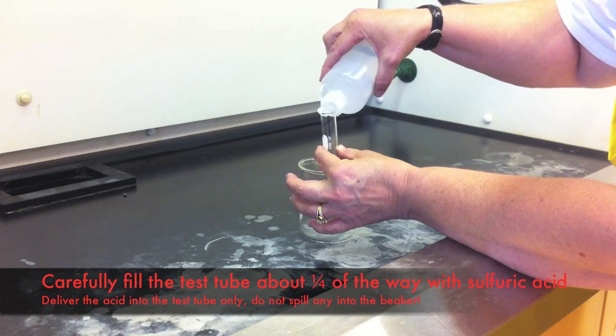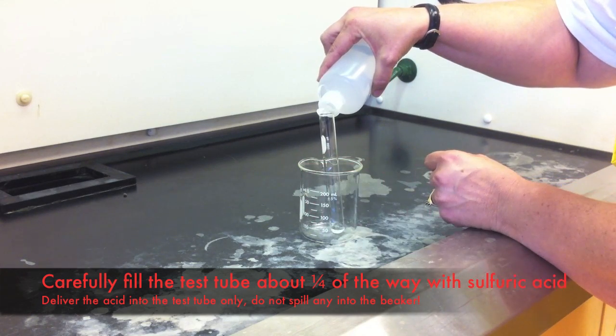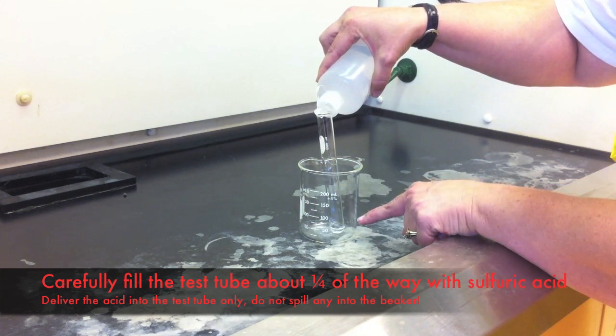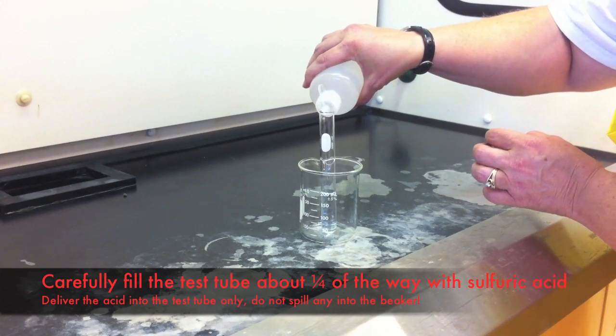You will need about a quarter of a test tube full of sulfuric acid. You will find the sulfuric acid in the fume hood. Carefully add it to the test tube and do not get any of it into the beaker.